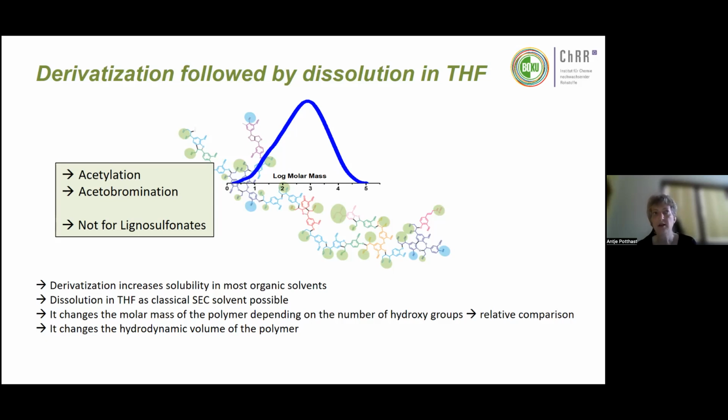And of course, you can say, okay, I can do a phosphorus NMR and measure all my OH groups, my aliphatic ones and my aromatic ones, and then I calculate back. Yeah, it's possible, but it's an extra expensive step. There's also this extra step of doing the acetylation. But if you need it for other reasons, it's a system which works, and I will show you later a quick version where you could nicely measure acetylated lignins.